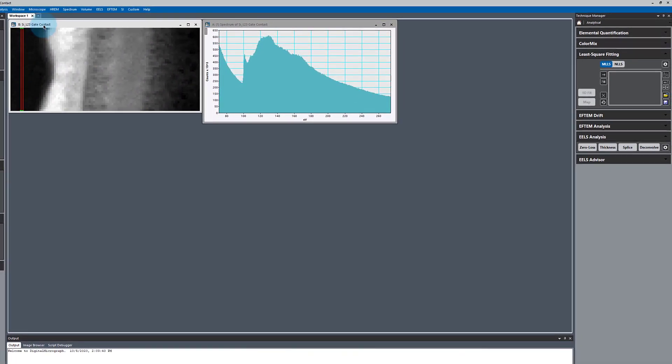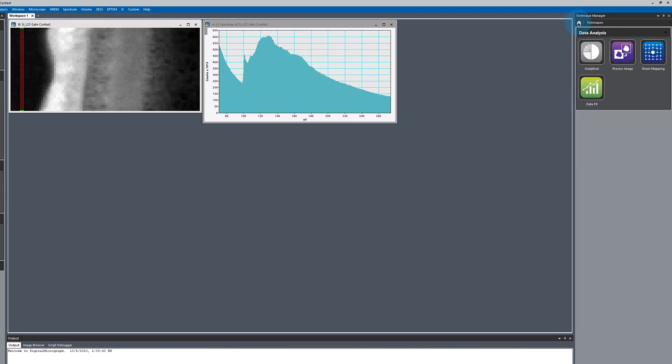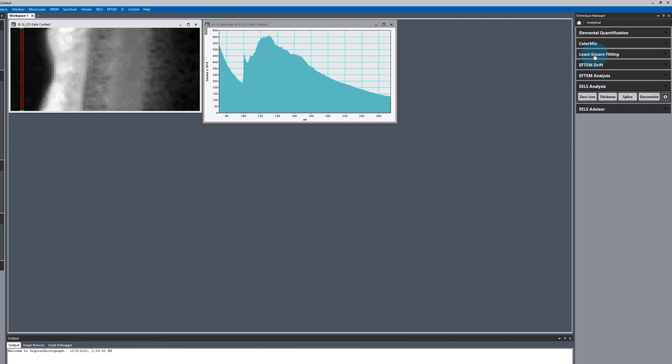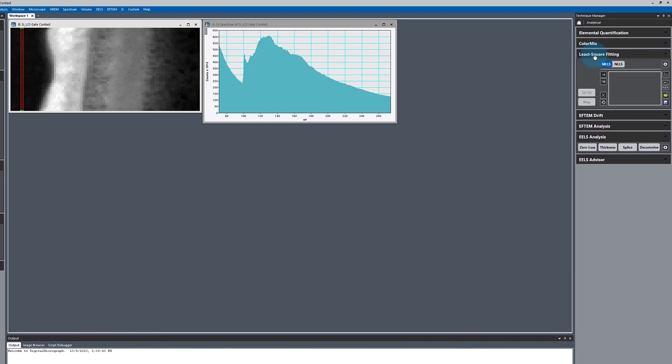The tool we're going to use to map out those phases is the Least Squares Fitting tool. If that's not open for you, just go to Techniques, either under Analytical or Data Fitting, and choose Least Squares Fitting.